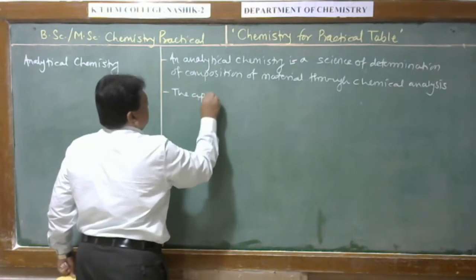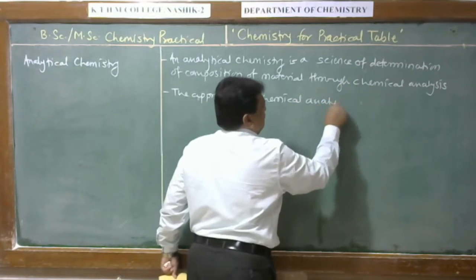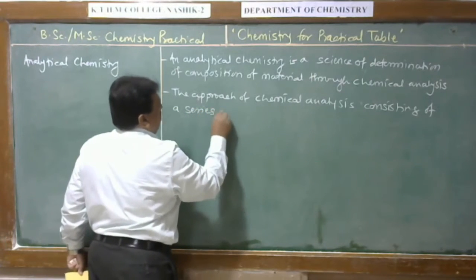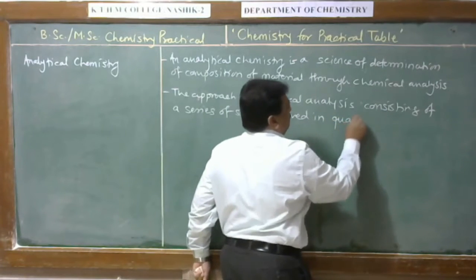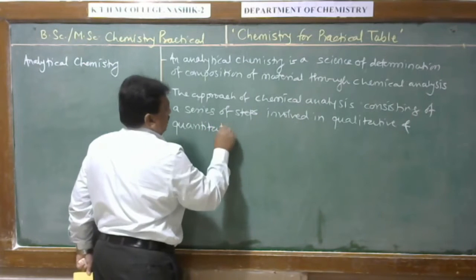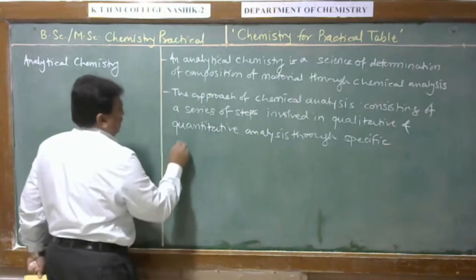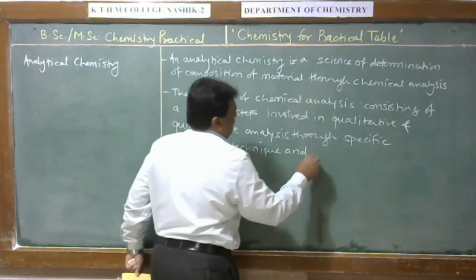The approach of chemical analysis consisting of a series of steps involved in qualitative and quantitative analysis through specific analytical technique and analytical method.